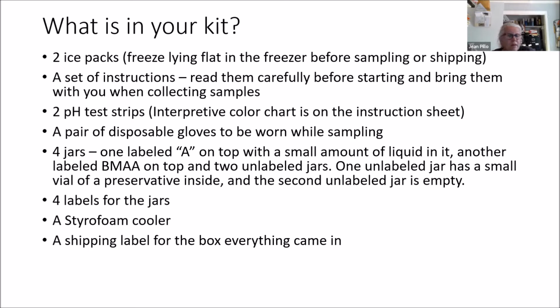You get 4 labels to stick on these jars before you send the samples in. The kit comes with a styrofoam cooler, and it has a shipping label. They also forgot to put that in the box, so I did make the extra effort to make sure the shipping label came in for everybody. So that's what they gave you.